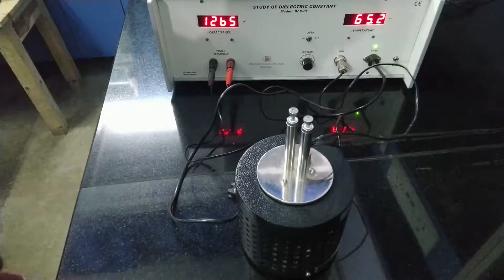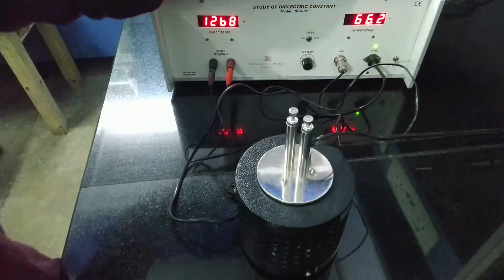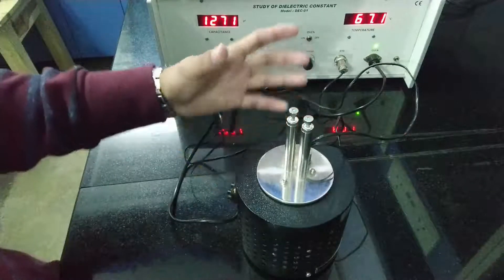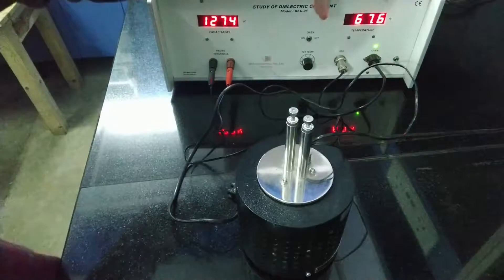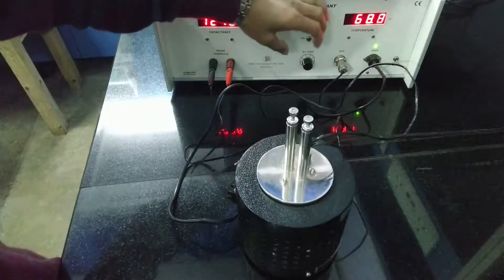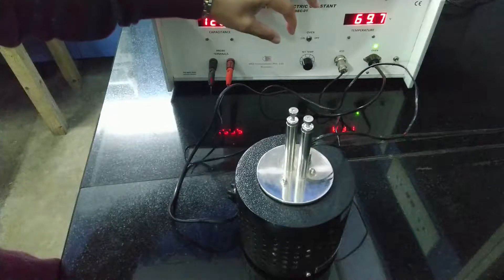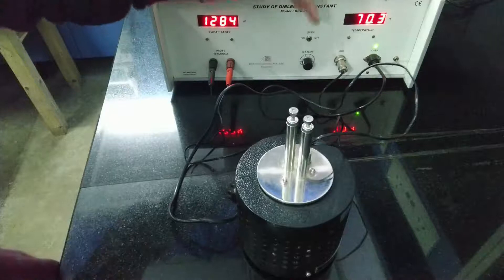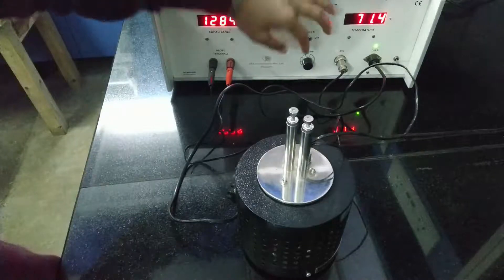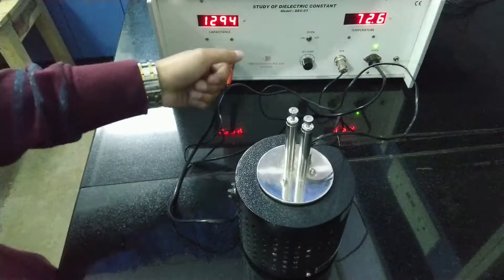Whenever the temperature exceeds our set value, the oven turns off automatically. Whenever that situation happens, you have to increase the set temperature a little bit again — by a small increment. When it exceeds that set value again, it will turn off again, so you have to keep on increasing it a little bit at a time.